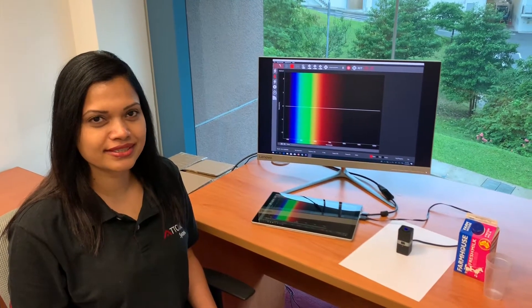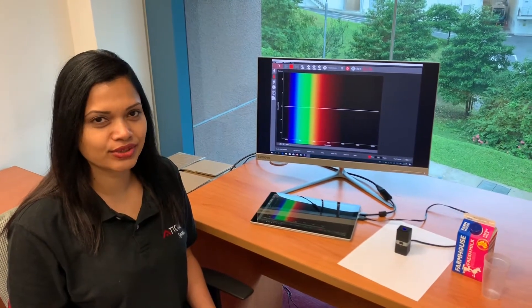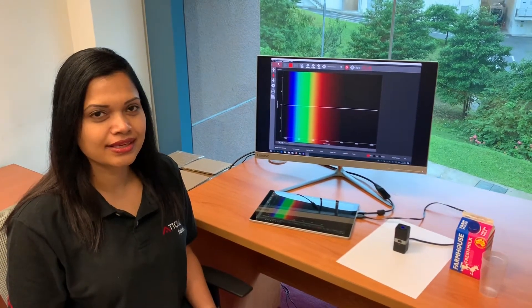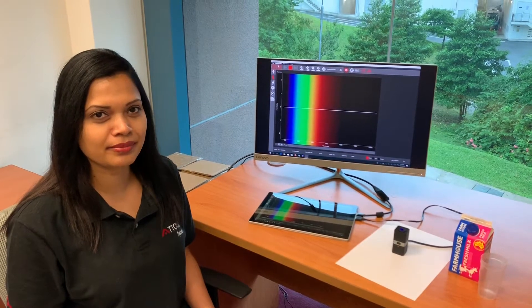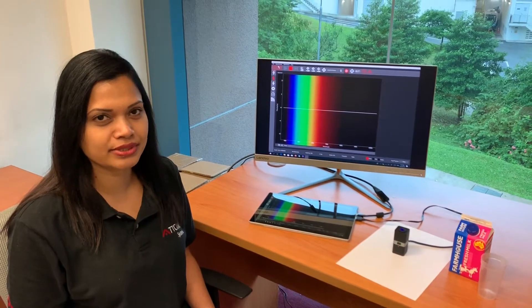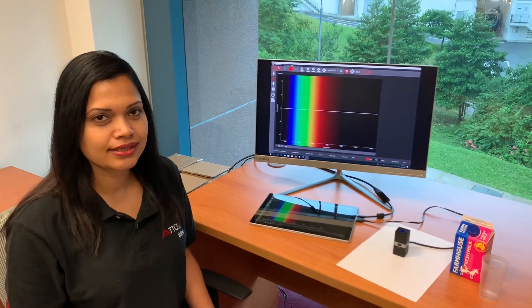Hello again from the research lab of Atomic Systems. This video demonstrates the measurement of liquid samples.